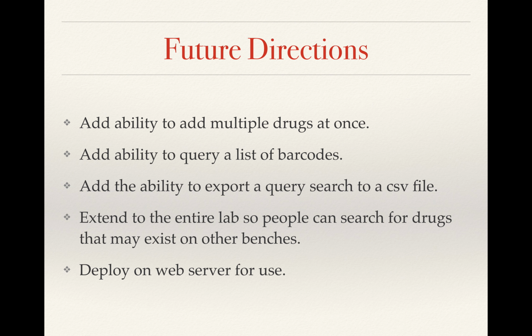And so finally, I'd like to quickly return back to the presentation and talk about future directions. I'd like to add the ability to add multiple drugs at once. I did look into this. It's quite complicated, at least for me. I'd like to be able to add in like 10 drugs. Now, I can do this by using my command, but it would be really nice to have a form to do this. So I'm going to work on that.